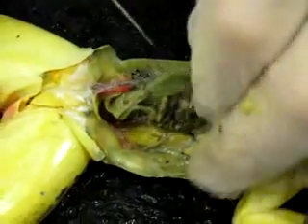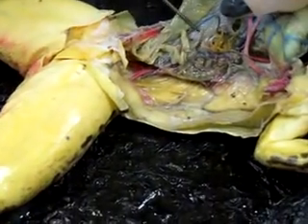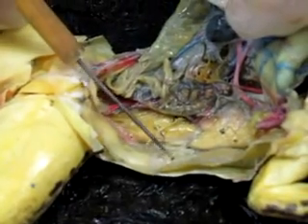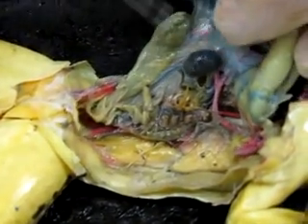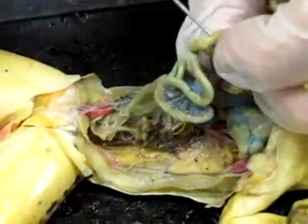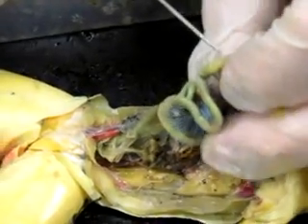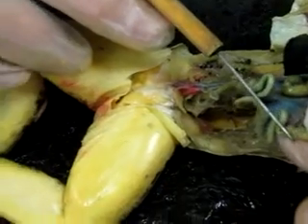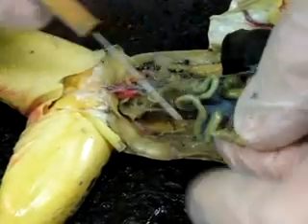It's formed from this material back here called the peritoneum. All this lines the body cavity is called peritoneum. This saran wrap back here is all peritoneum. It forms the mesentery where the two come together, and where the mesentery surrounds the intestines here, this is the visceral peritoneum. So I have parietal here, I have mesentery here, and visceral here. That's the 3 types of peritoneum.